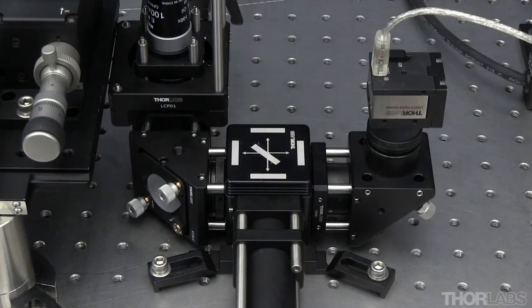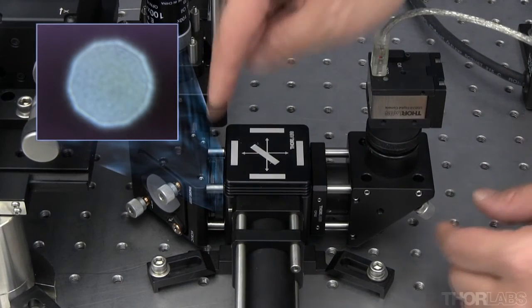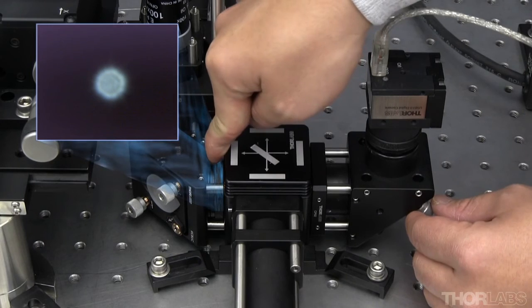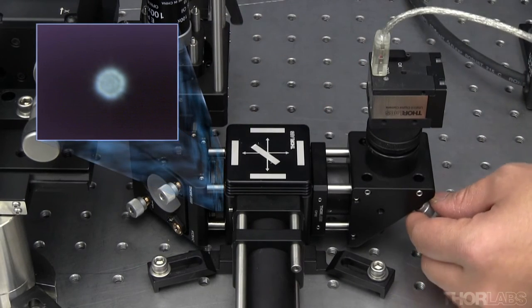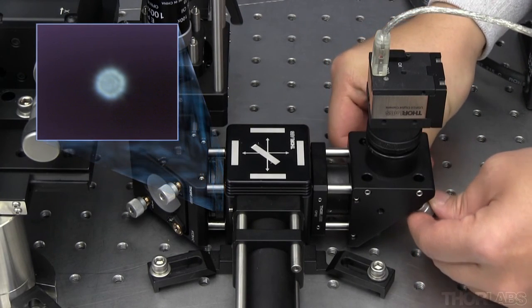Turn on the white light source and observe the image on the camera. Close the camera's iris and, using the camera's mirror, center this dot on the camera. Once centered, remember to open the iris once again.